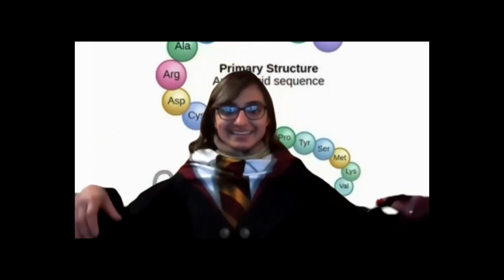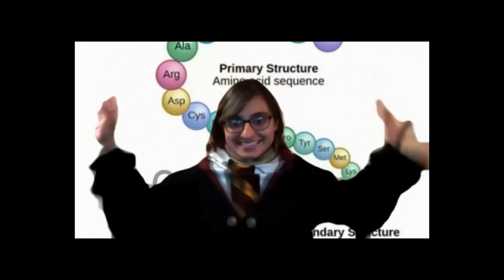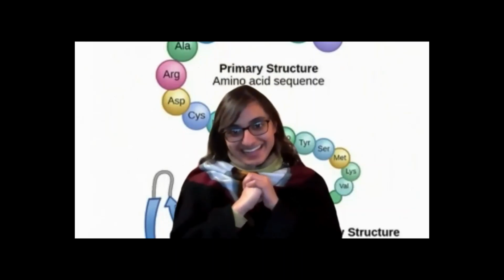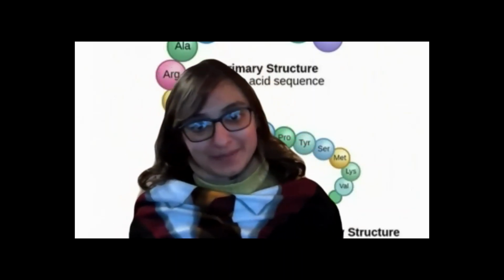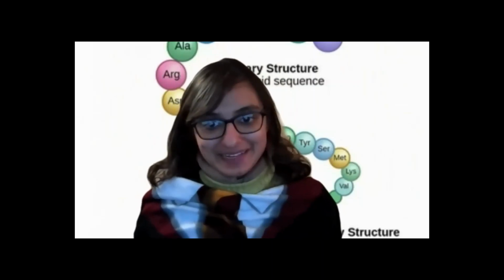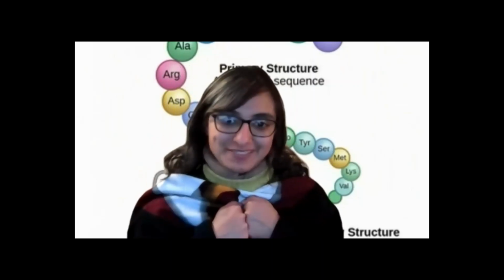So in the spirit of Harry Potter, I'm going to say Alakazam. Again, I showed you can run this on one peptide or multiple peptides as well. So I hope that you run it and it works for you.